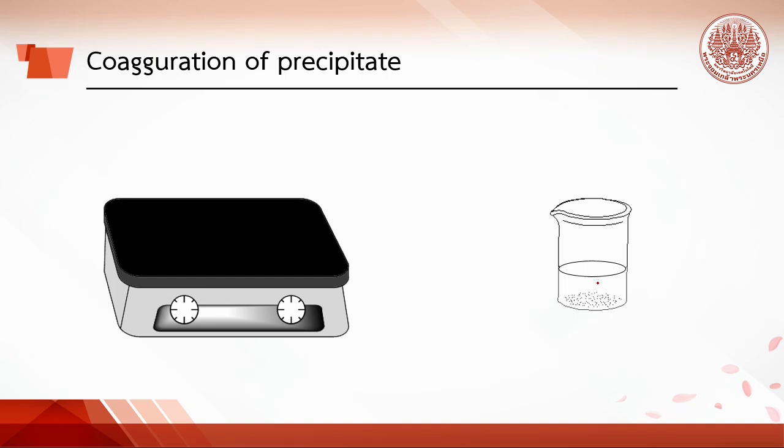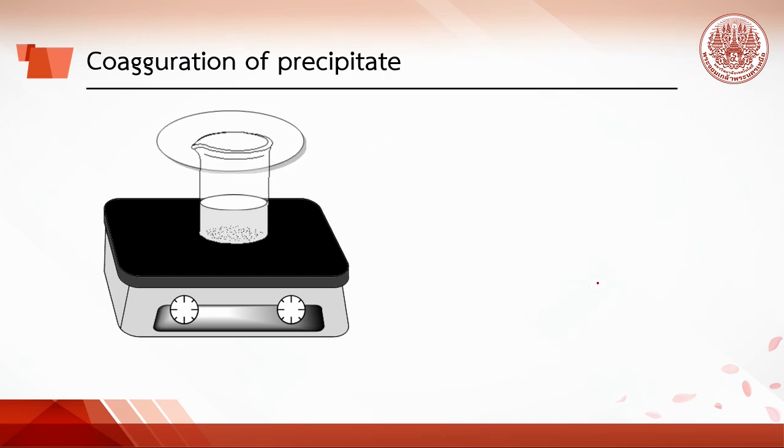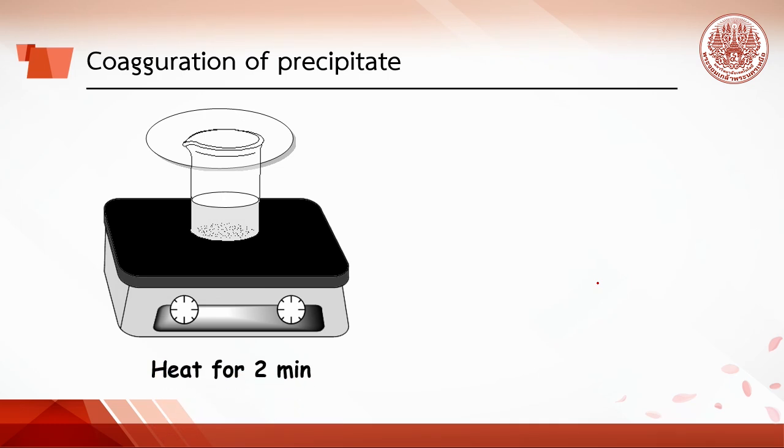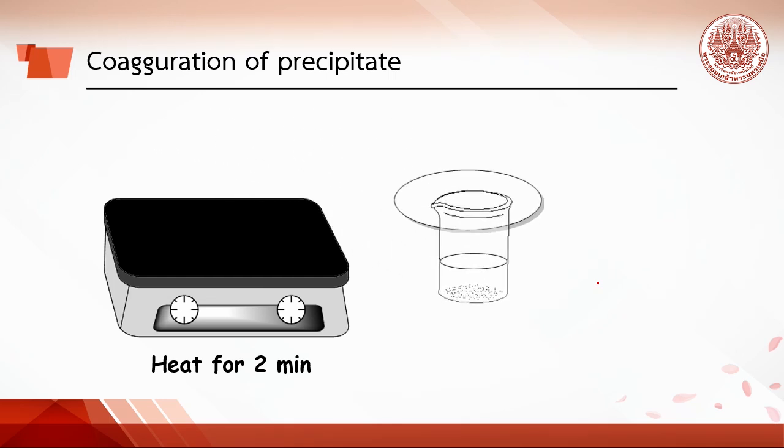To make it easier for filtration, the solution with precipitate is covered with watch glass and heated for 2 minutes. This process will help particles coagulate and become larger particles. Then, let the solution cool down.